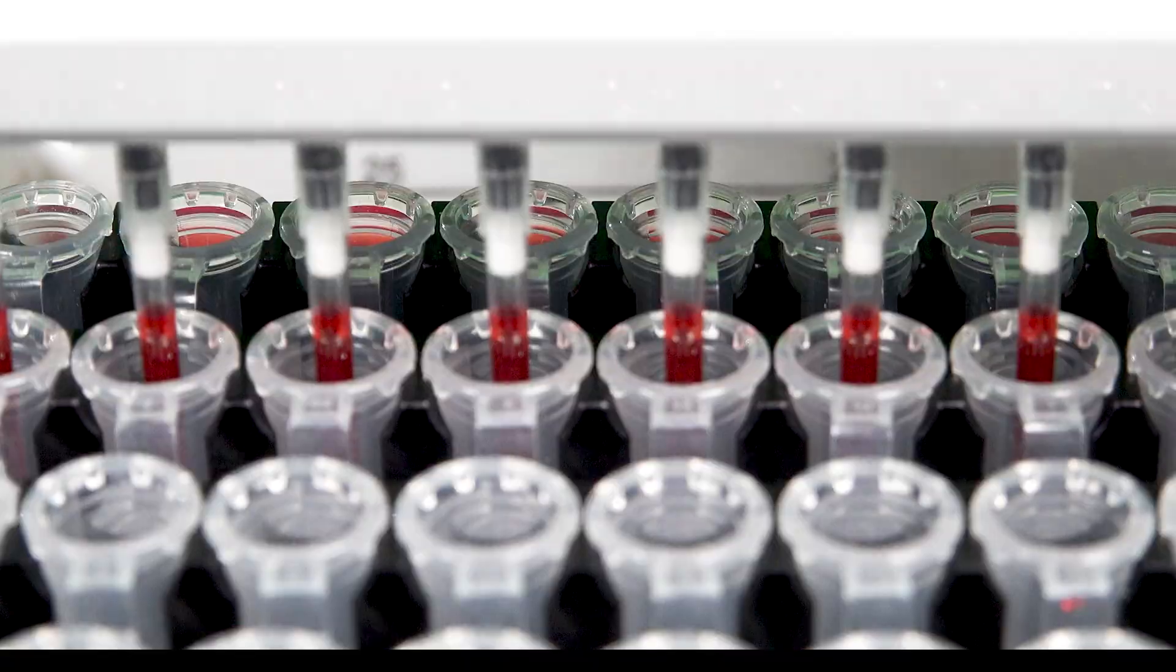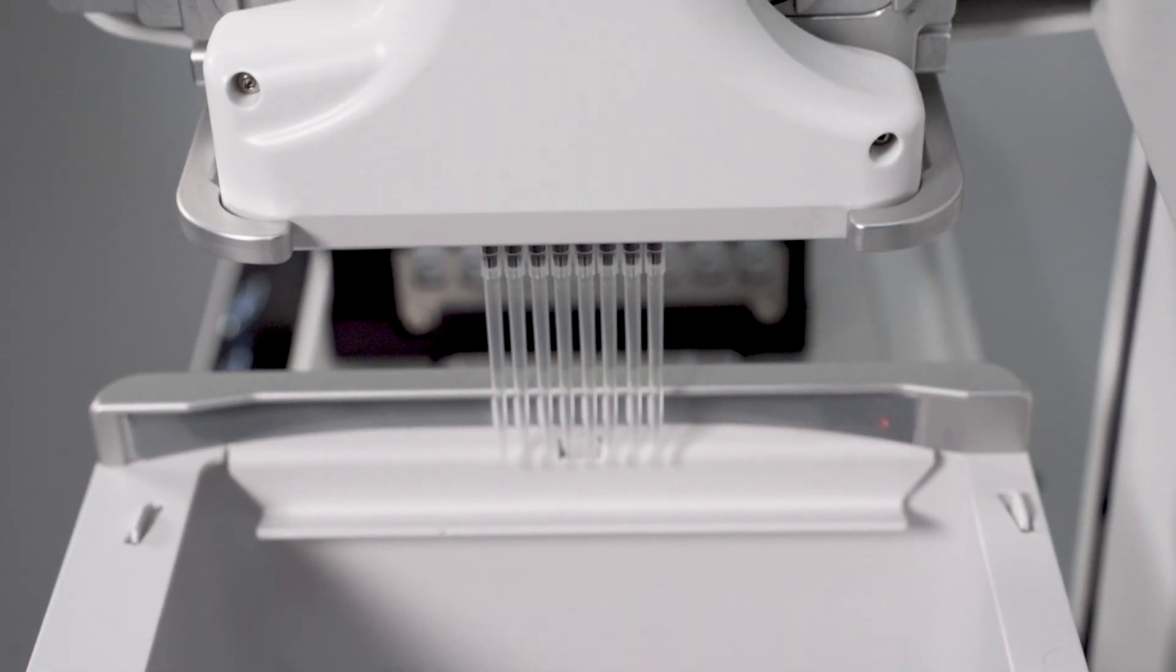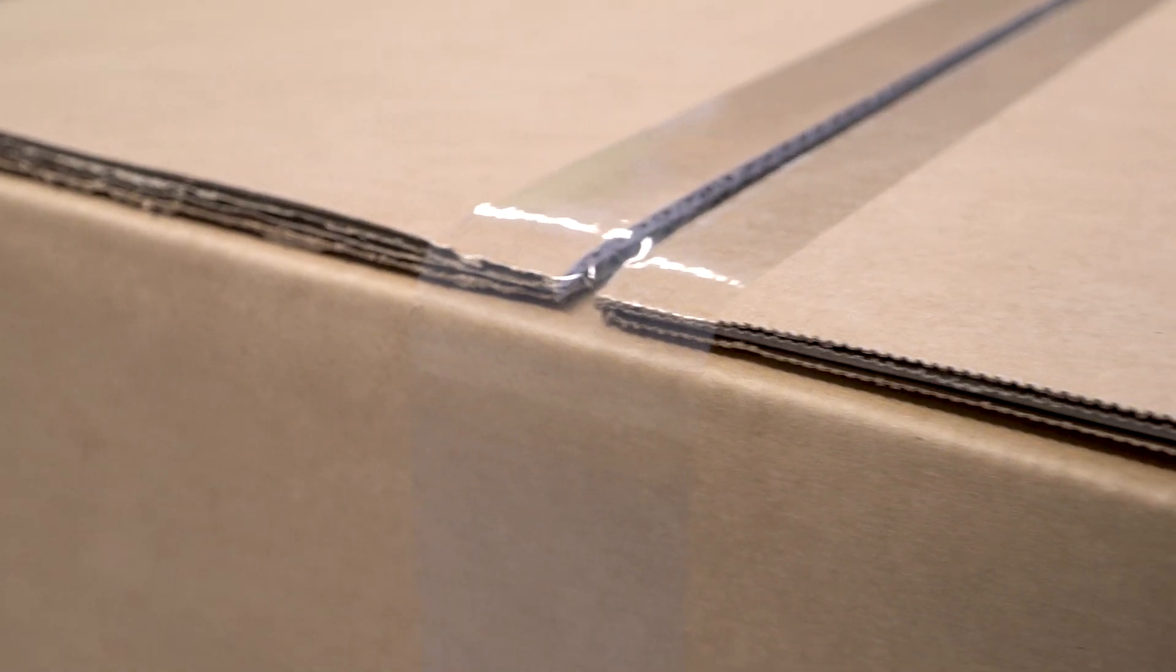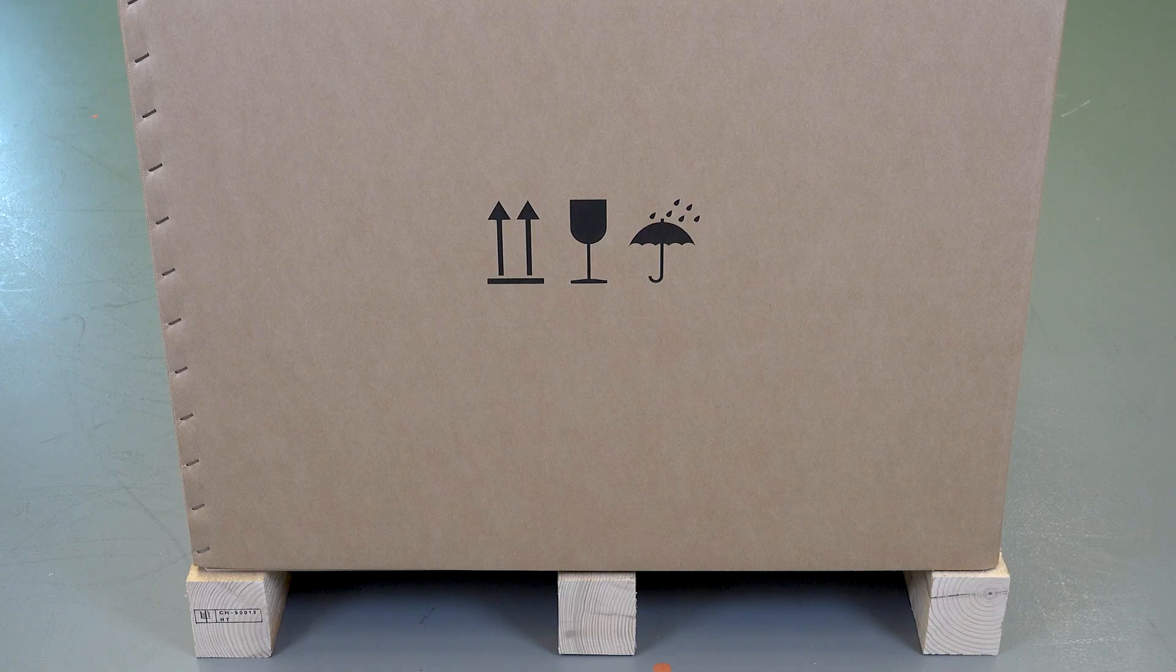Today we want to show you how to install the Assist Plus Pipetting Robot from Integra. The instrument is delivered on a wooden crate and is covered by a carton box.